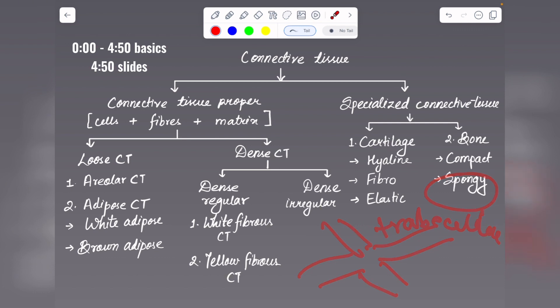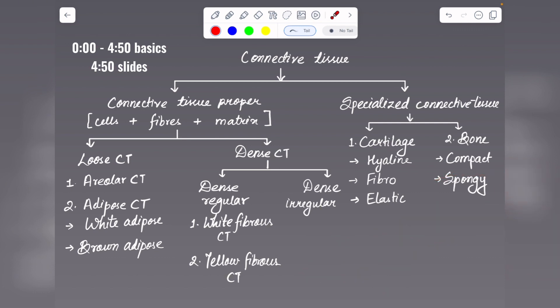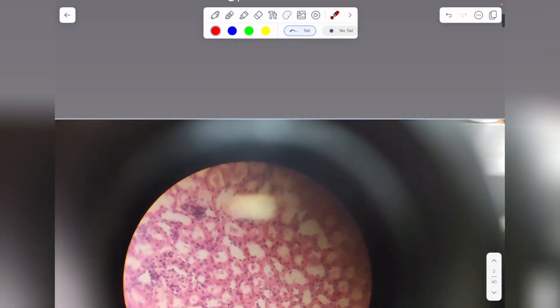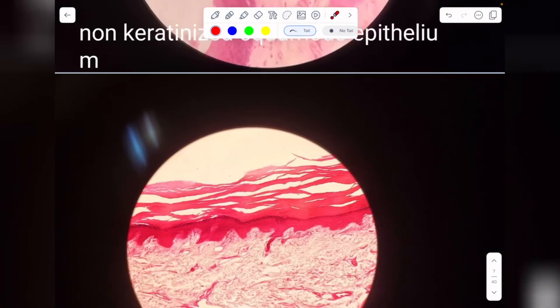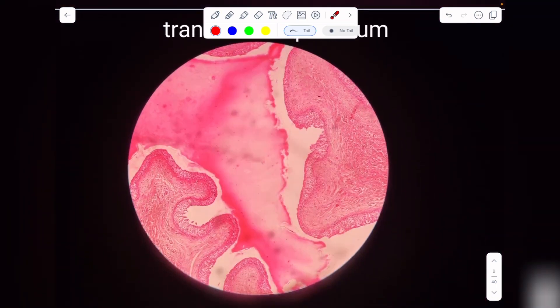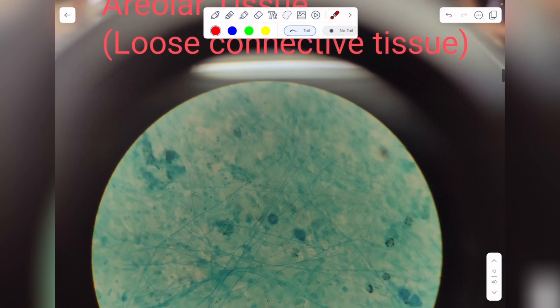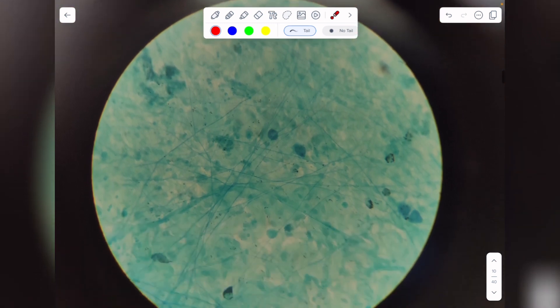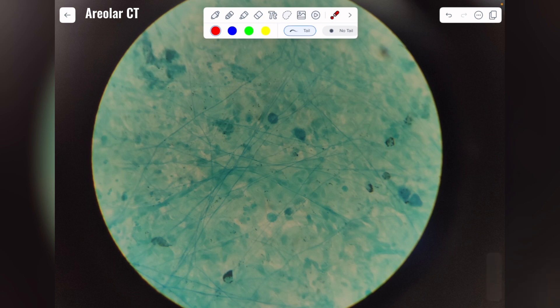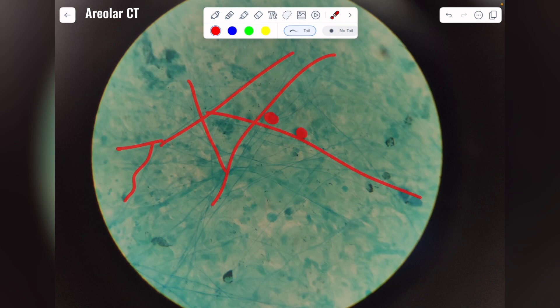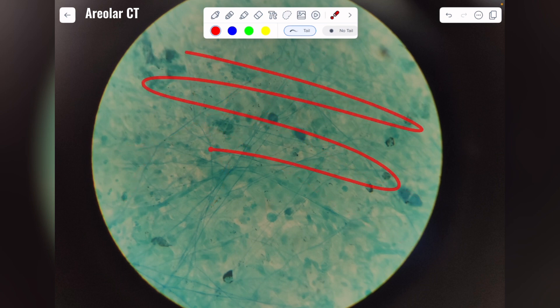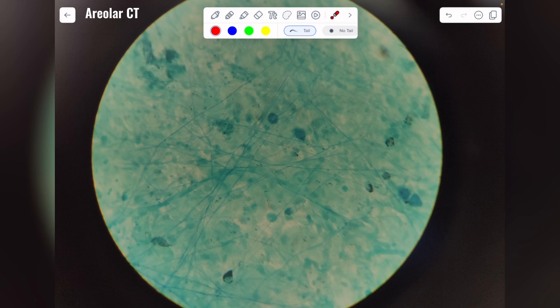Now let's look at the slides. Under connective tissue proper, starting with loose connective tissue: this is areolar connective tissue. These are the nuclei of cells and these are the fibers, and you can see that the cells and fibers are loosely arranged on a whitish matrix. So this is areolar connective tissue.